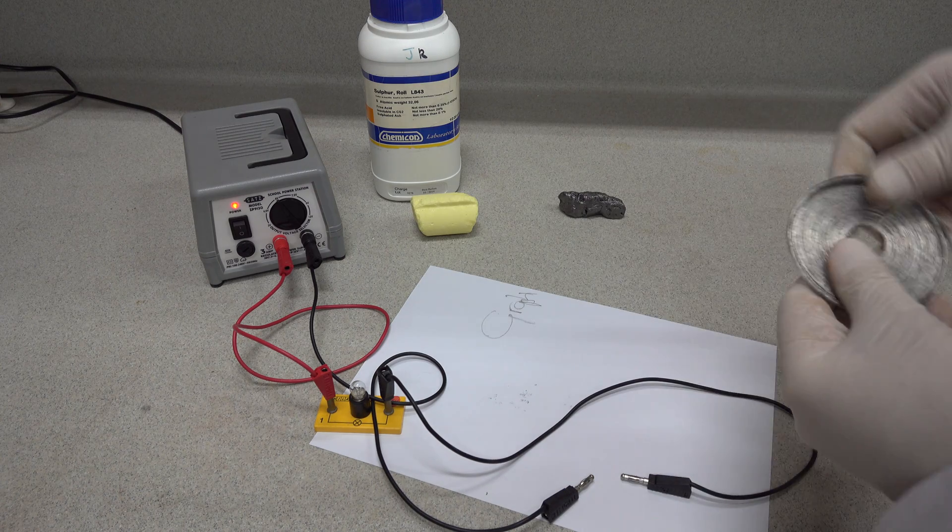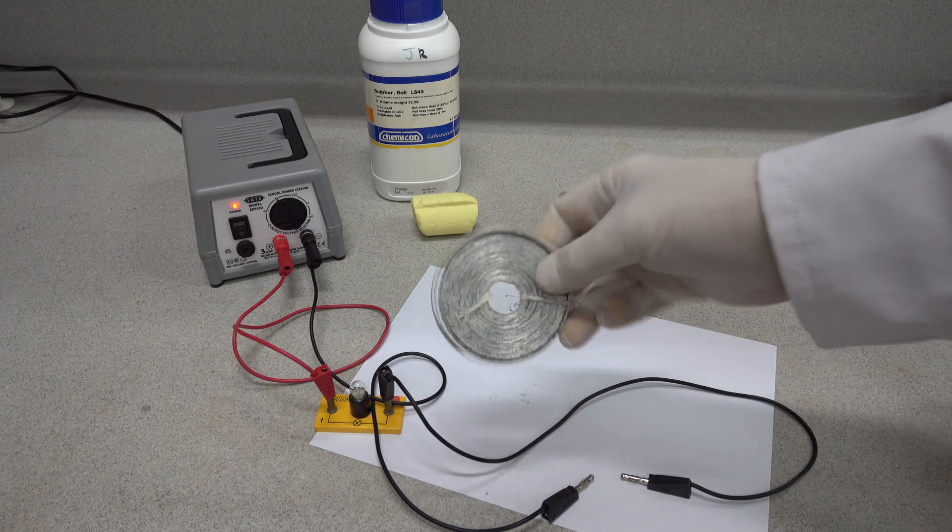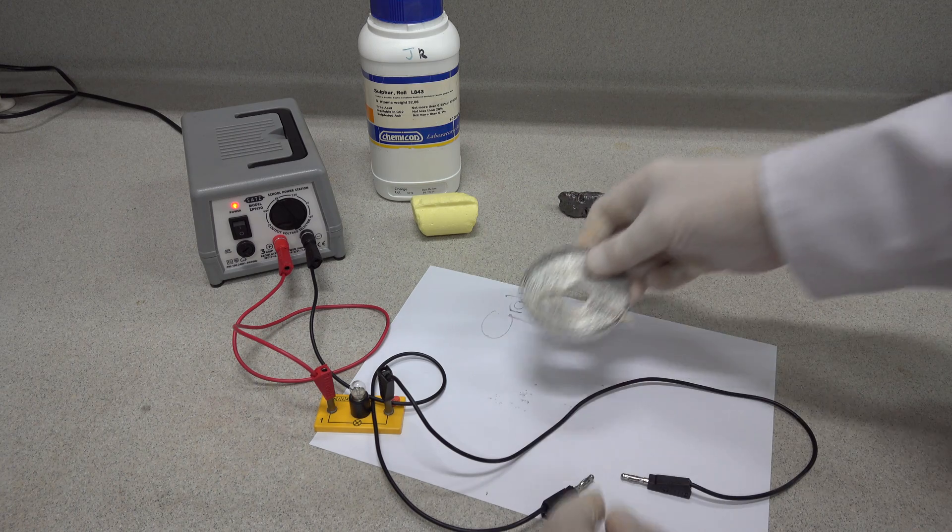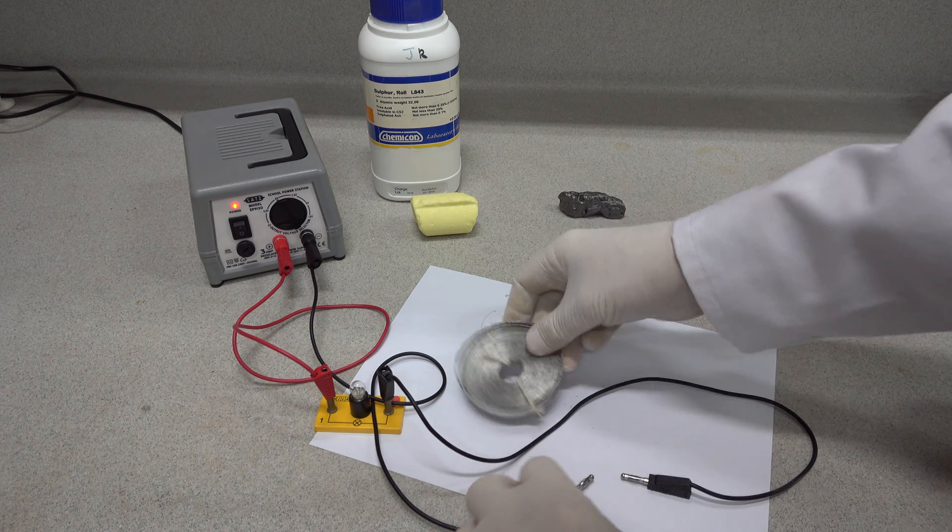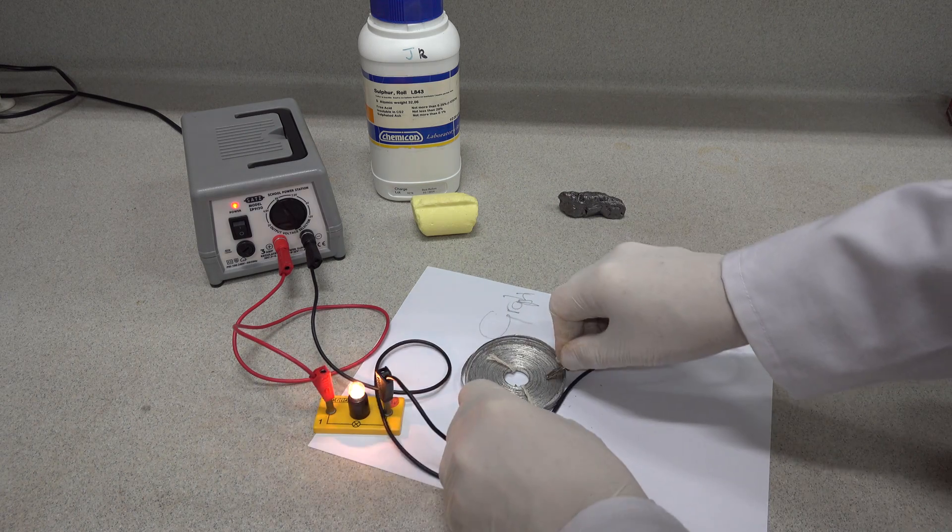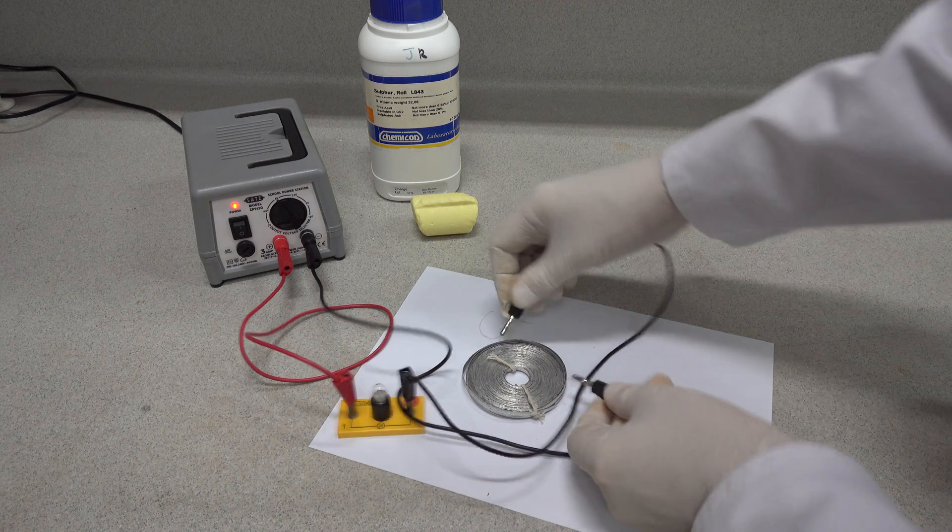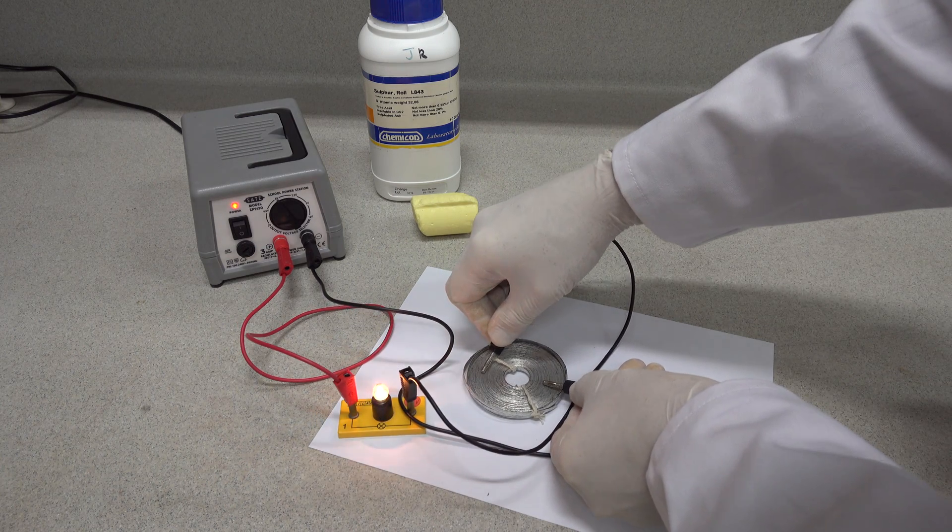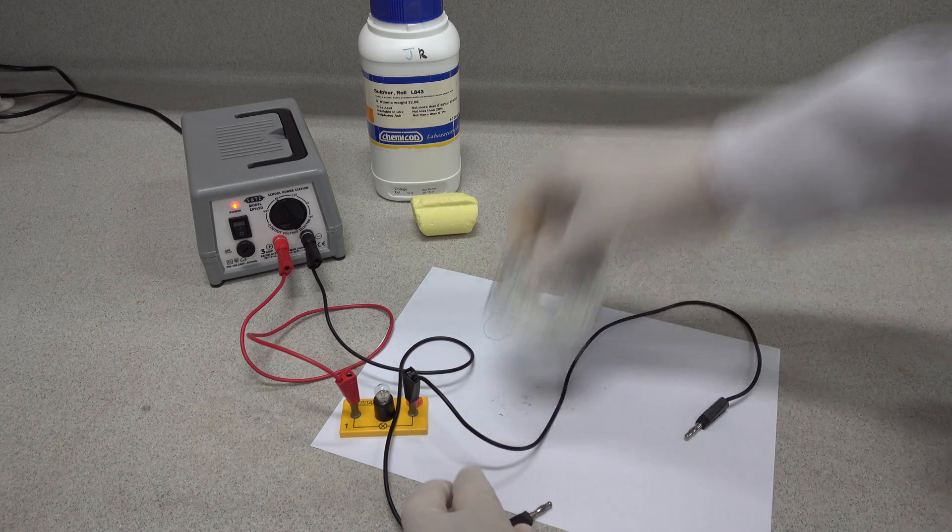On to our next element, which is a roll of magnesium ribbon. And if we put the electrical contacts onto the magnesium ribbon, yes, it conducts electricity again rather well.